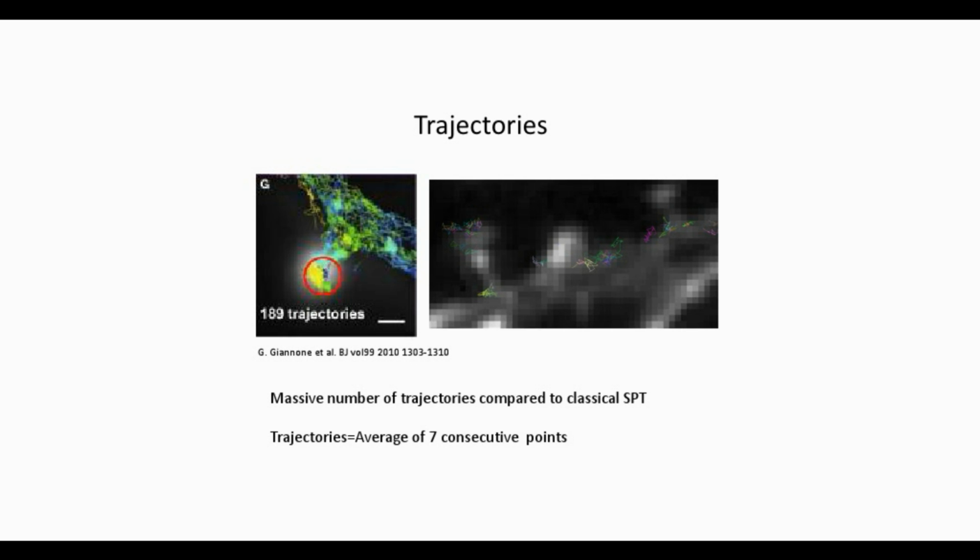The data are actually a collection of small amounts locally of trajectory. Actually, that can also be, if you wait sufficiently long, a large amount of trajectories. So it's like an ensemble of points that are connected in time, and we suppose that this is done by a tracking algorithm. So you have a time t1, time t2, time t3, and so on. Usually we assume that the time step delta t is constant between tk plus 1 and tk. And so we get an ensemble of short trajectories, of about 7 consecutive points. Here is an example where this delta t was about 50 milliseconds.